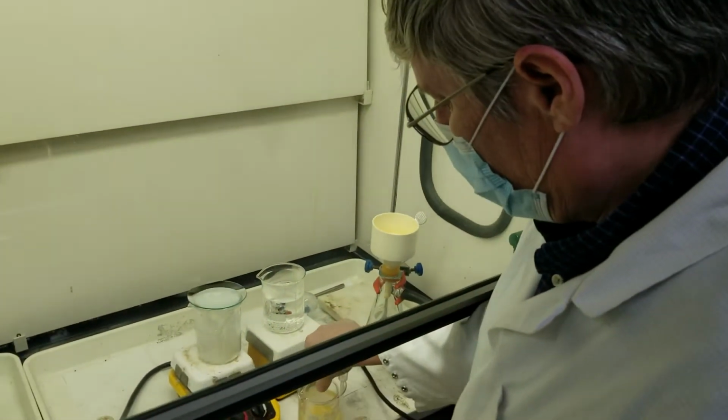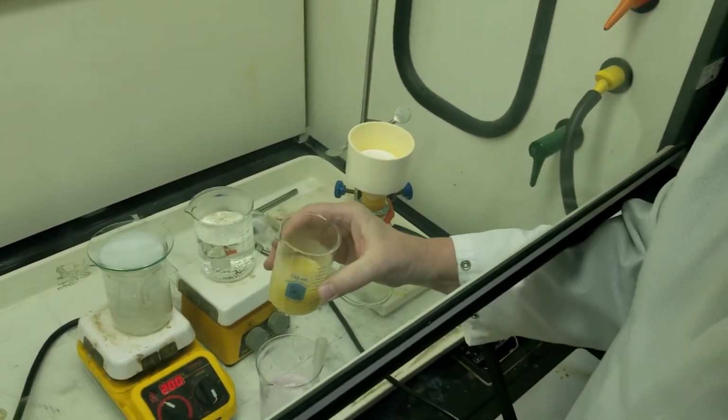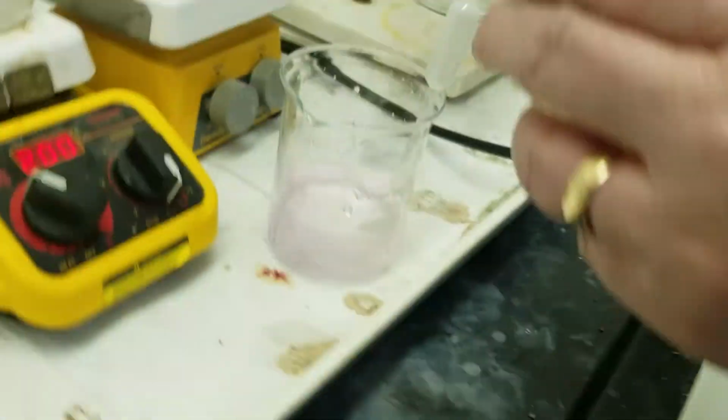Okay, so we're going to ice it. We have iced our crude product. Most of our crystals have crystallized in this aqueous solution. We're going to do a really fast crude filtration as soon as we turn on the suction.